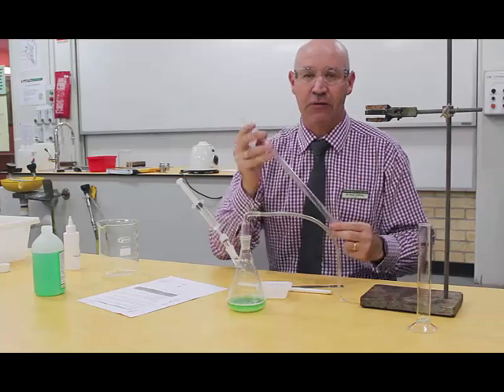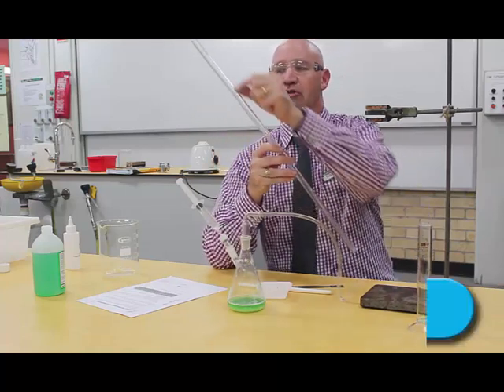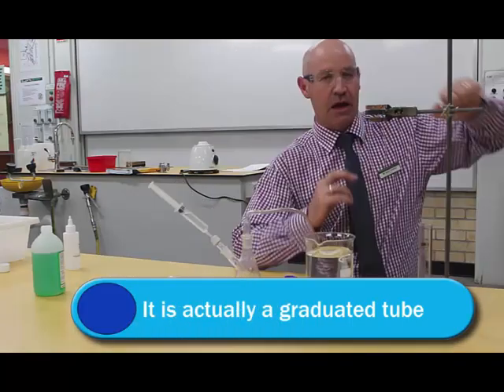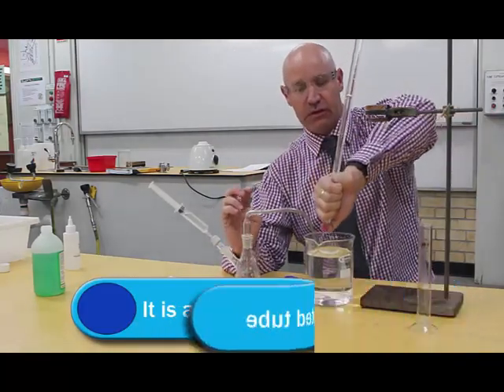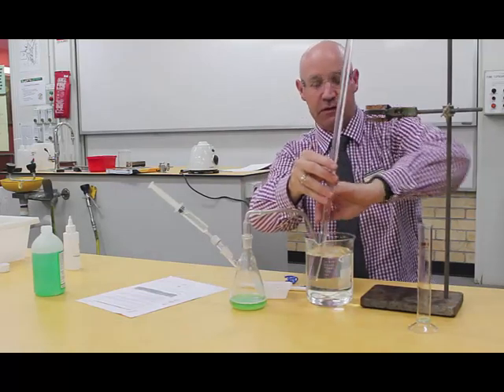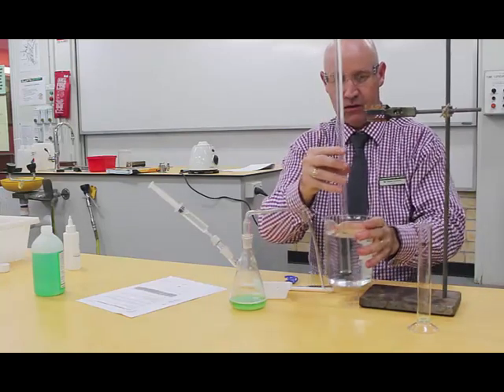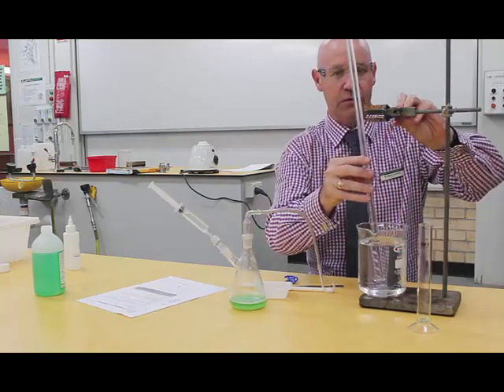So we're measuring the amount of oxygen that gets produced, the amount of oxygen bubbles that get produced in our measuring cylinder. And I have filled up my measuring cylinder. Now I'm going to just take my thumb off underwater, and as you can see, there's no air in that measuring cylinder. And I'm going to secure that to a retort stand.